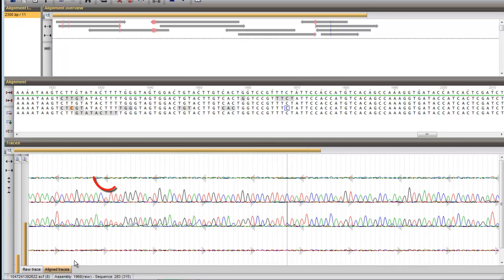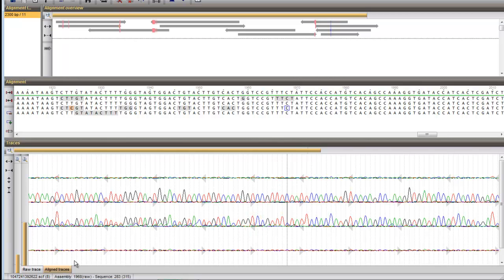The gray arrows indicate whether the trace was used in forward or reverse direction. The zoom sliders may help to visualize some areas better.